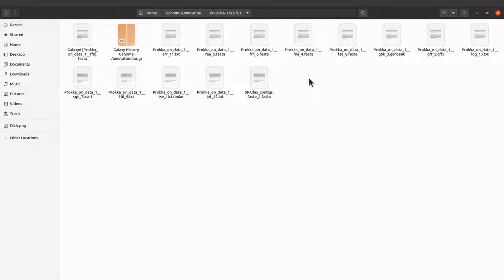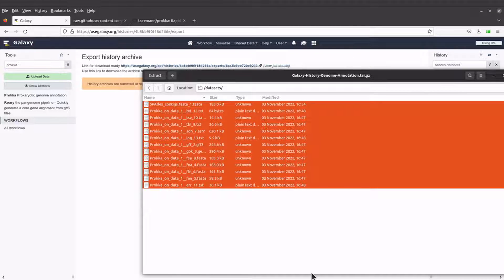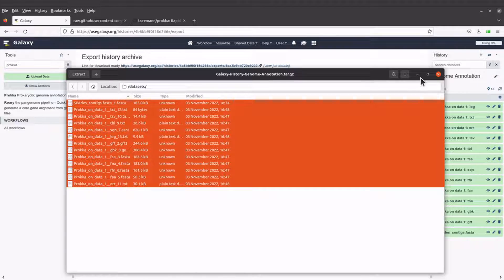You can then use Python or other tools to open the appropriate files and continue the analysis. I have tutorials on Python and how it can be used to open features in a GenBank file — make sure you watch those videos.